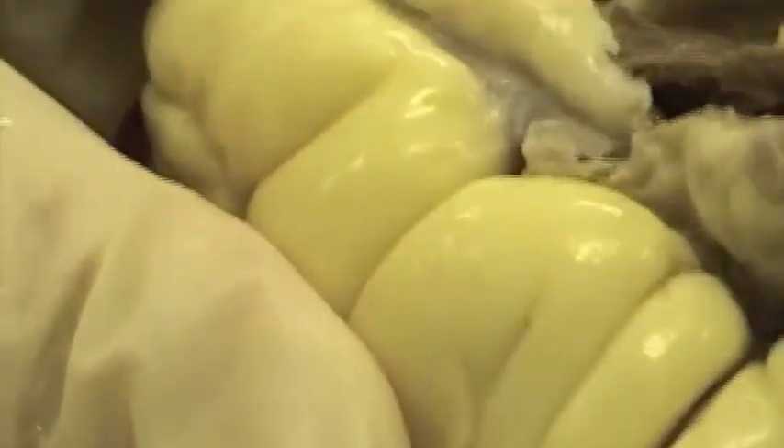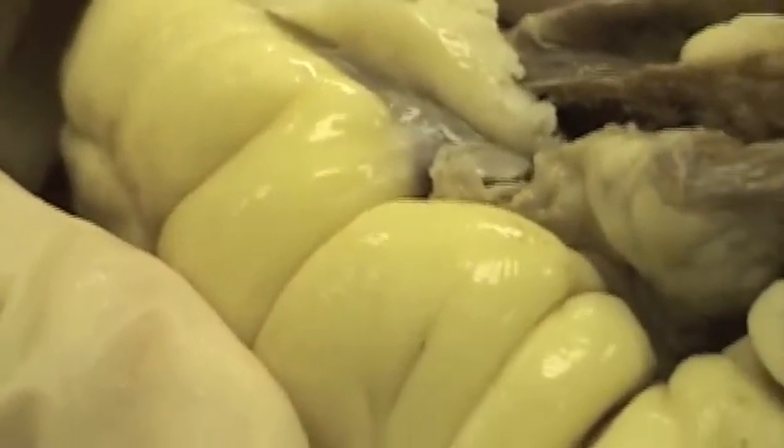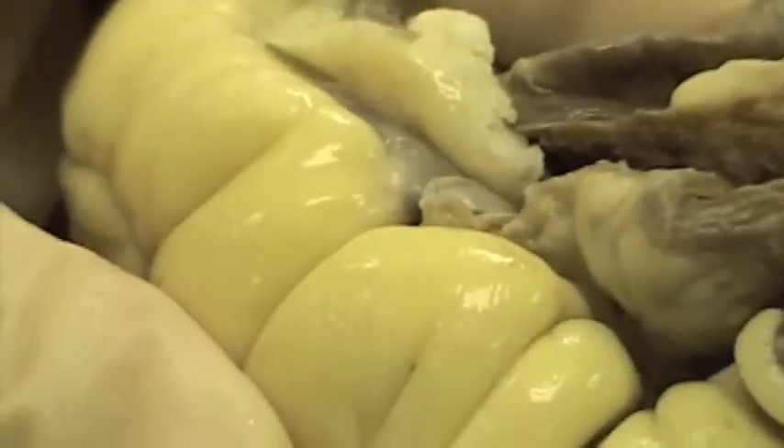The probe right there is the coronary sinus. See where it's moving? That's the opening to the coronary sinus right there.